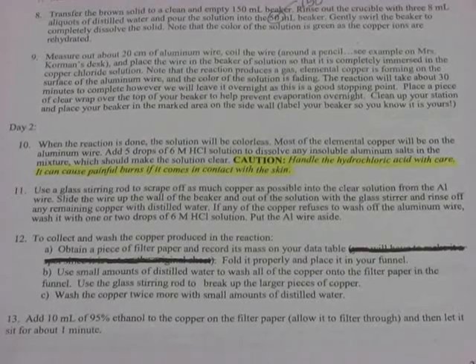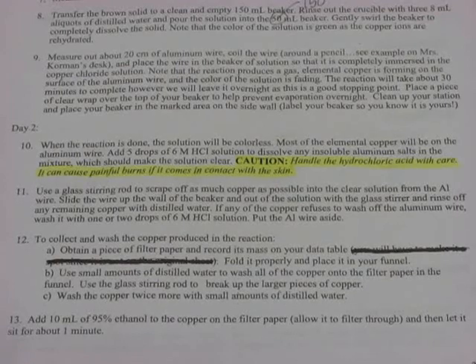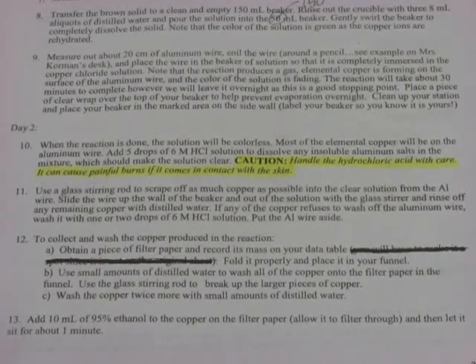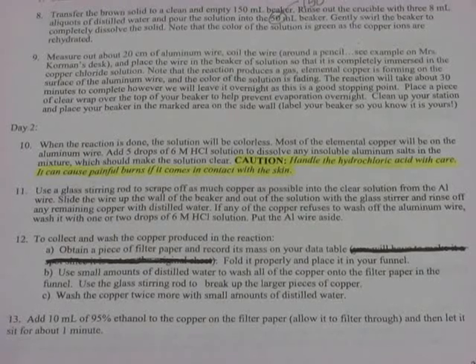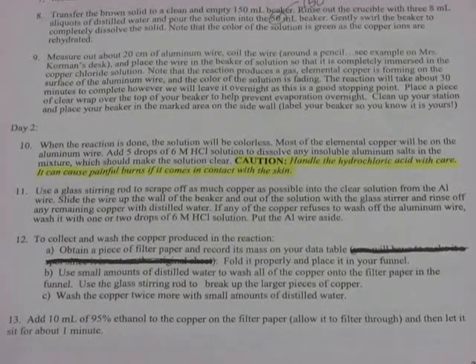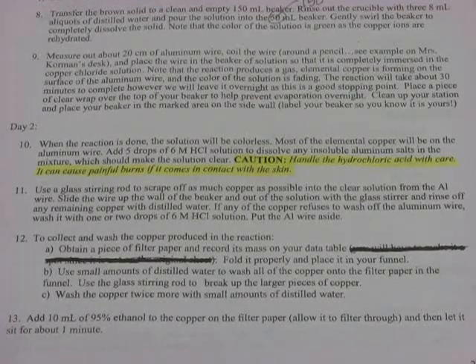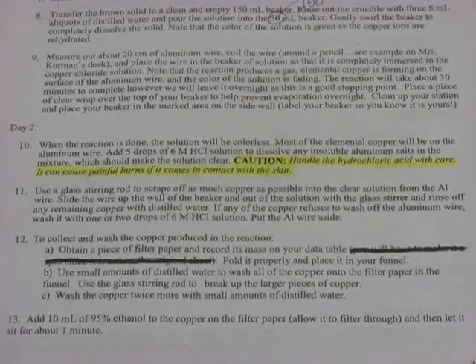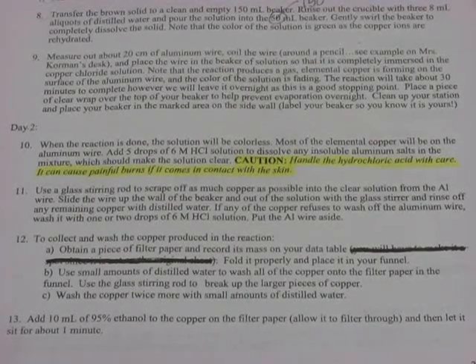And if you would please go to step number 10 and highlight where it says caution, handle the hydrochloric acid with care. It can cause painful burns if it comes in contact with the skin. So please note that we are using some chemicals that can cause burns. So please use precautions, make sure you're paying attention to what's happening around you, and if an accident does occur, please let me know as soon as possible.